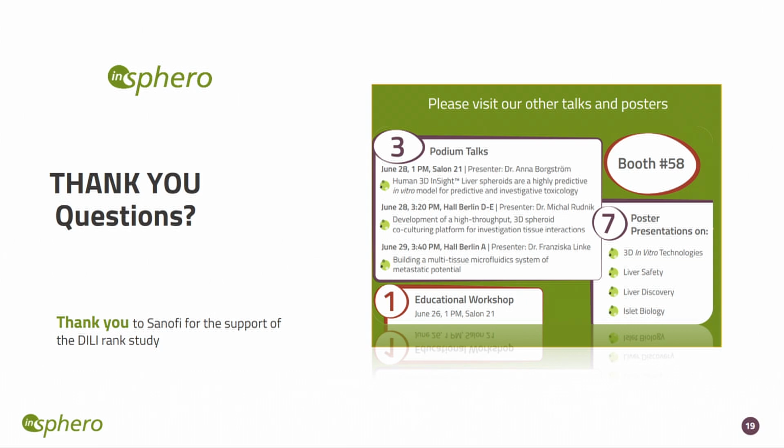For this specific study, we are not considering to do this. We are trying to find a more general approach which can be used for the majority of pharmaceutical companies. However, there could be... But with 10 donors, you can really lose this effect, because maybe all your donors have no polymorphism at all. So you study the same effect in each donor, which is not informative for the general population. It's hard to know. We are not screening for that when we select our donors. But again, this is something which can be selected if this is of interest for a specific project. We're trying now to be broad and to represent the bigger majority of the population, but there is no specific criteria which we are looking for when we are selecting the donors.